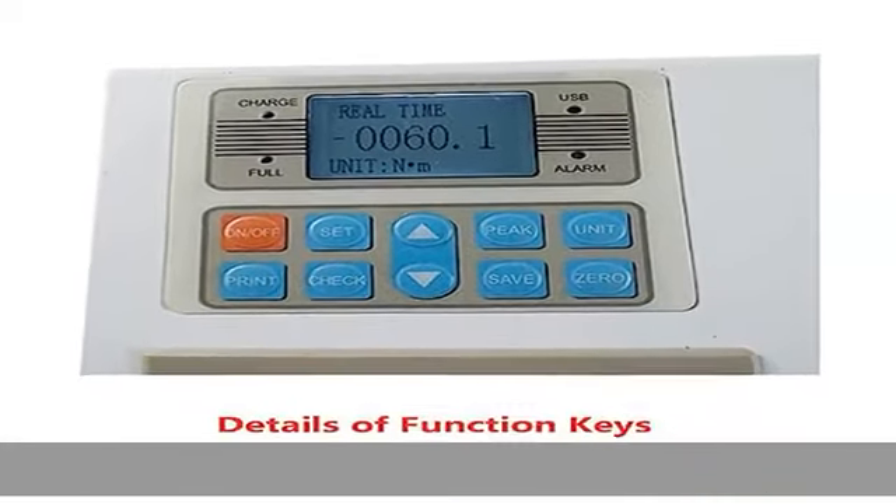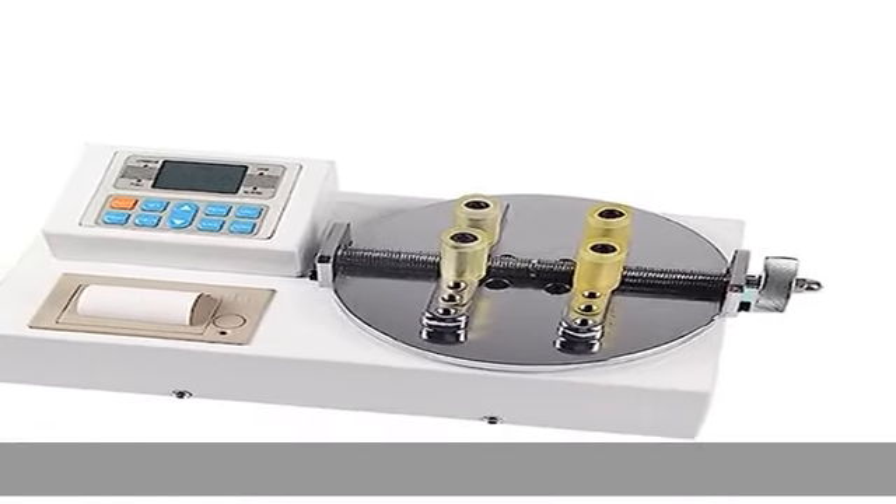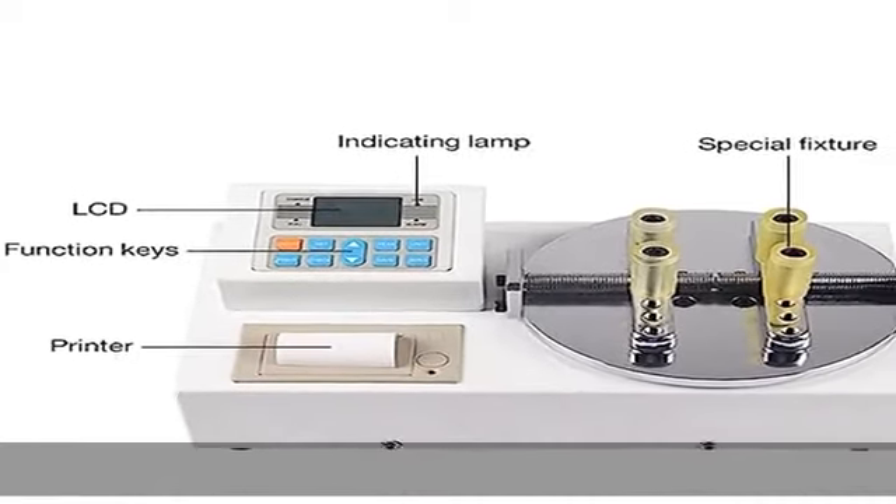Upper and lower limit value setting with red and green indicating lights and buzzer audible and visual alarm. The digital bottle lid torque meter is an intelligent multifunctional measuring instrument designed for testing various kinds of bottle lid torque.